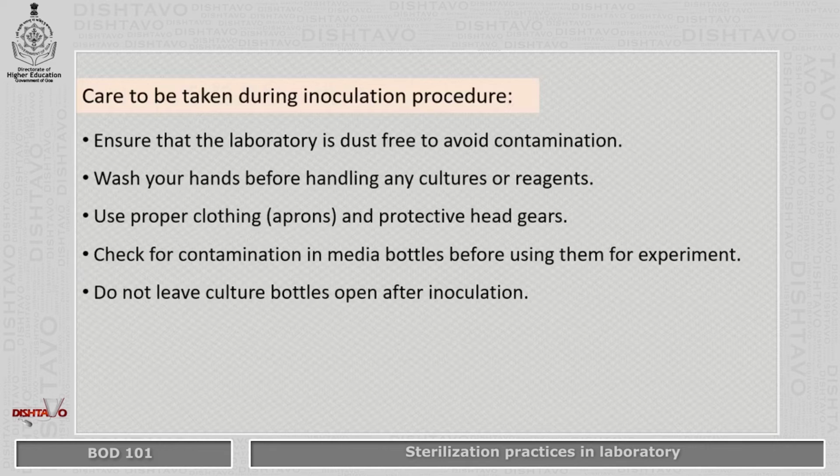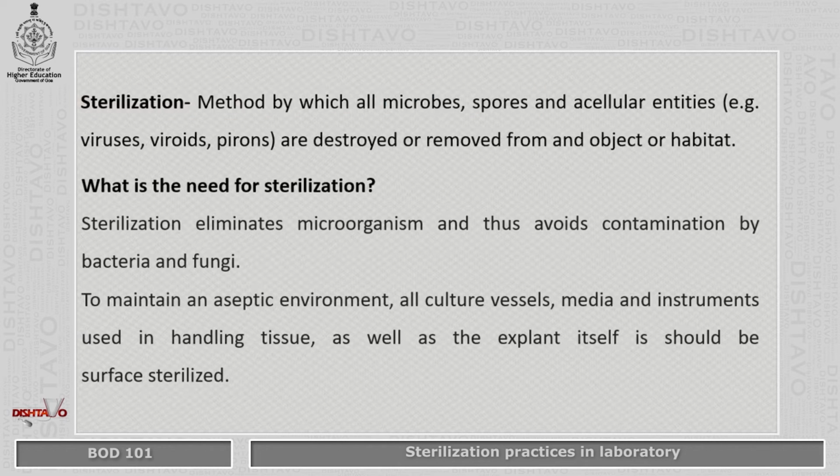Care to be taken during the inoculation procedure: ensure that the laboratory is dust free to avoid contamination. Wash your hands before handling any cultures or reagents. Use proper clothing, that is aprons and headgears. Check for contamination in the media bottle before using them for the experiment, and do not leave any culture bottle open after inoculation.